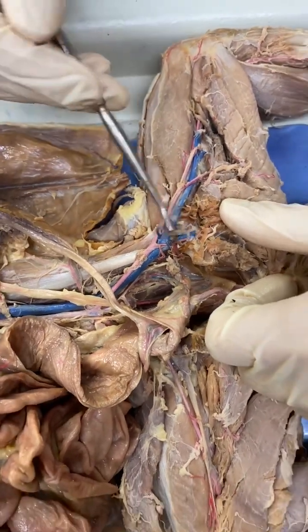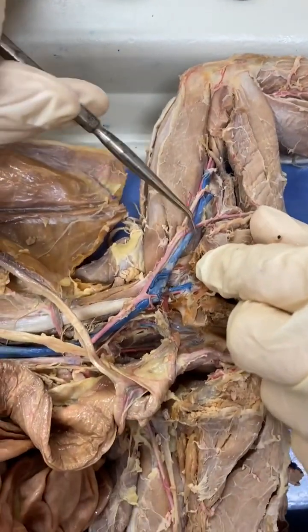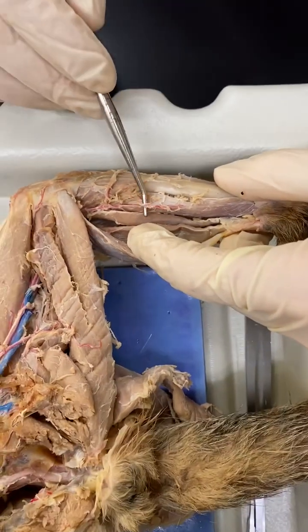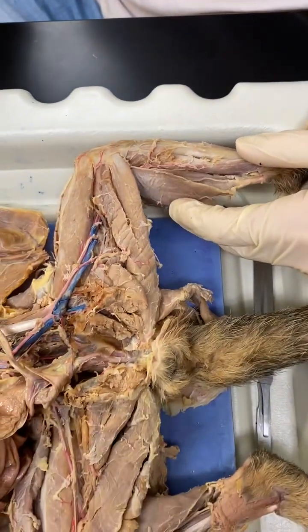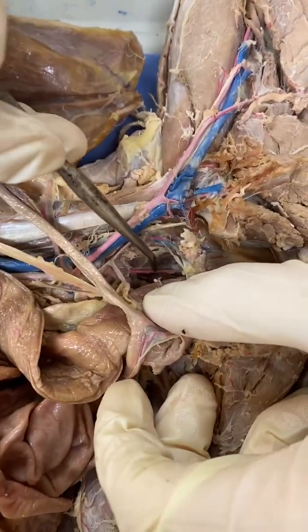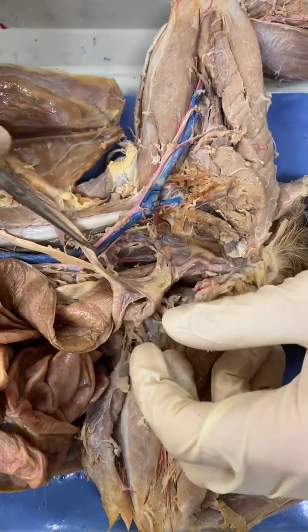Femoral artery and vein. Femoral artery, femoral vein, saphenous artery and vein. Saphenous artery, and then I do not think that the dye was successful with the vein. And then the caudal, like a medial sacral artery and vein. Caudal artery right here, right in the middle, and then I do not think the dye was successful with the vein.